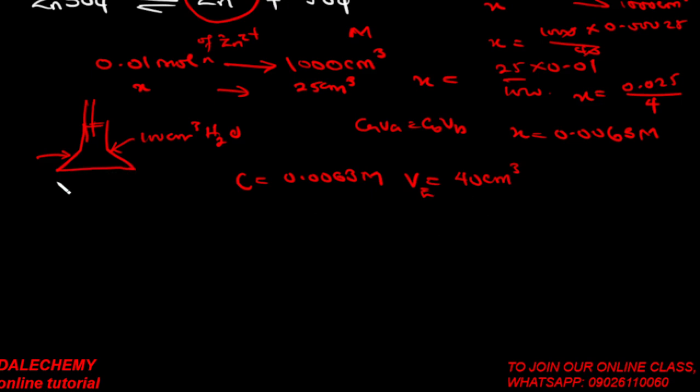Then the next thing is that you want to calculate what is actually reacting in this water, which is calcium 2+ and magnesium 2+. Not the water actually, it is the metal part of the water that will be reacting with the EDTA, because EDTA always reacts with metal, and water is hard because of the calcium and magnesium present in it. So those are the ones that will react with the EDTA. So you want to know the concentration of these two too.